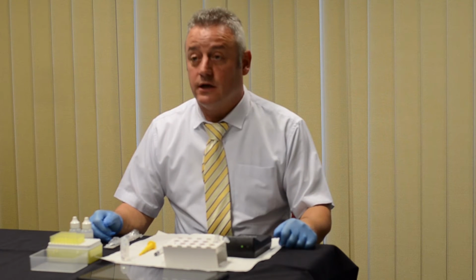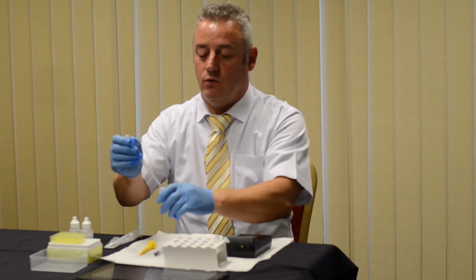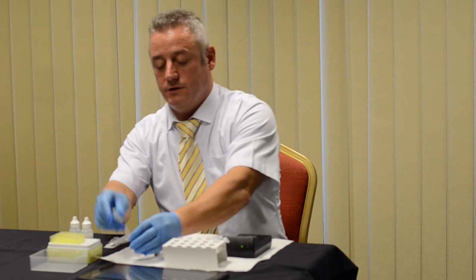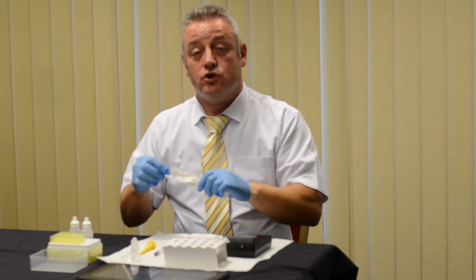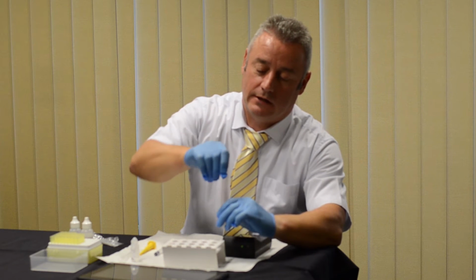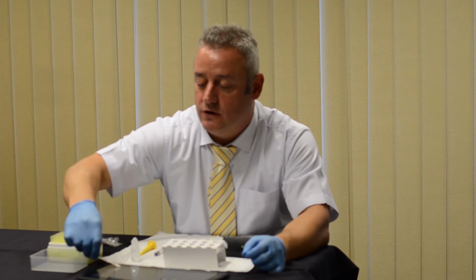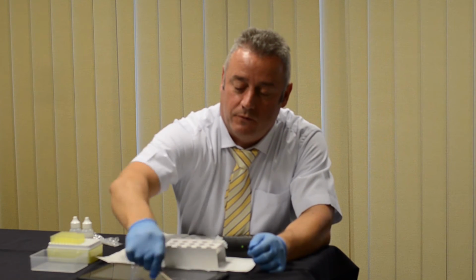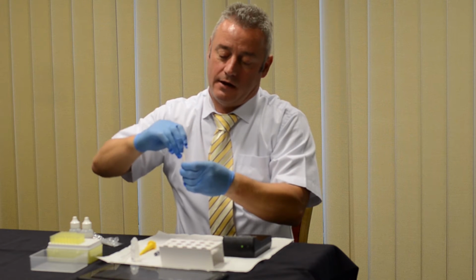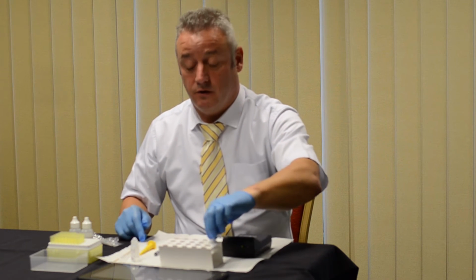So the next thing I'm going to do is prepare my swab and test this iPad type device. The first thing I do is take some sterile water, water for injections, half a ml, and place it into the micro test tube. Second thing I do is take a sterile, dry Dacron swab, dip it into the sterile water and just take any excess fluid off at the edges. Next, I roll the Dacron swab across the surface I want to test, in this case the iPad type device, and then dip it back into the water. And then again, I'm just going to dry off the Dacron swab. So that's my test material ready to go.